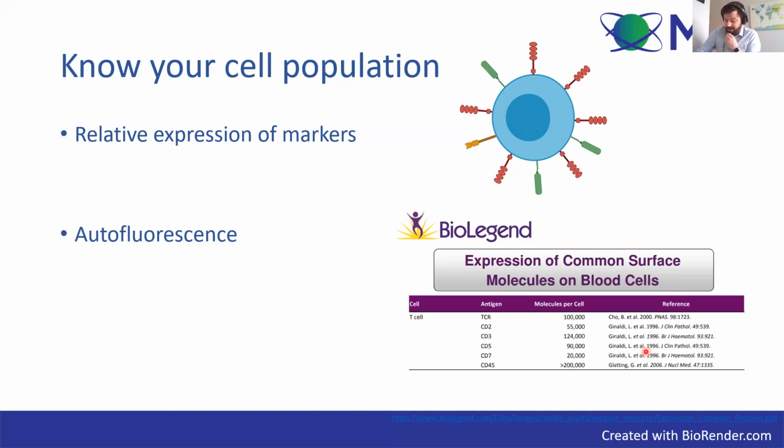The next thing to think about is dreaded autofluorescence. Basically all cells have some level of autofluorescence, and it can be caused by the presence of collagen, elastin, cyclic ring compounds like NADPH, and riboflavin, as well as organelles like mitochondria or lysosomes. A few things to note about autofluorescence: you'll often see it at lower wavelengths, for example in the FITC channel.